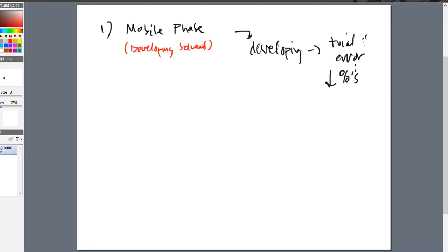So pick out something that you think is going to work. Pick a concentration percentage-wise, and then if that does not work according to plan, then you change the percentage in little baby steps, and we've talked about that, and you see how it affects the separation. Do not do anything drastic. Do not do anything other than small changes at one time.